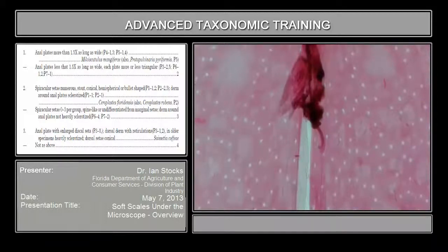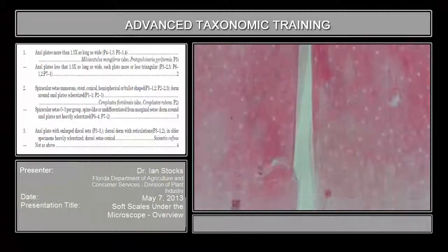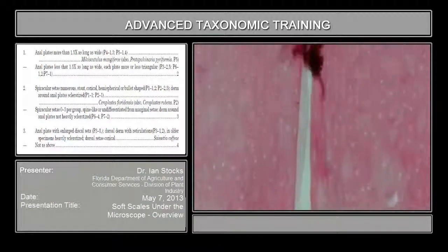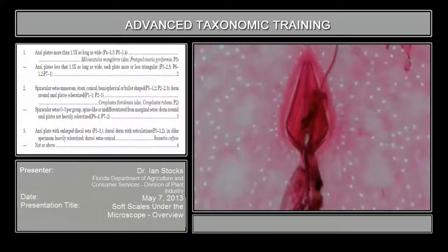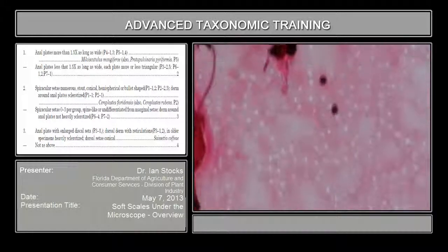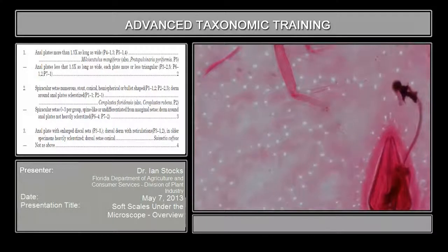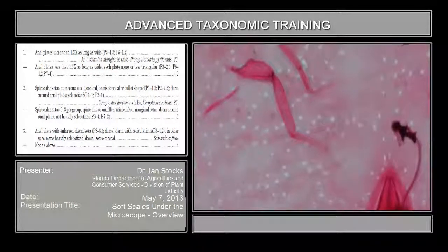Because the anal plates are paired, they form a kind of slit-like structure that continues down the body until it gets to the margin here. That's the anal cleft, and the length of that can be important as well for diagnosis. So we'll continue, and we're going to go pick up a leg. Let's go pick up a leg now. Any leg will do.